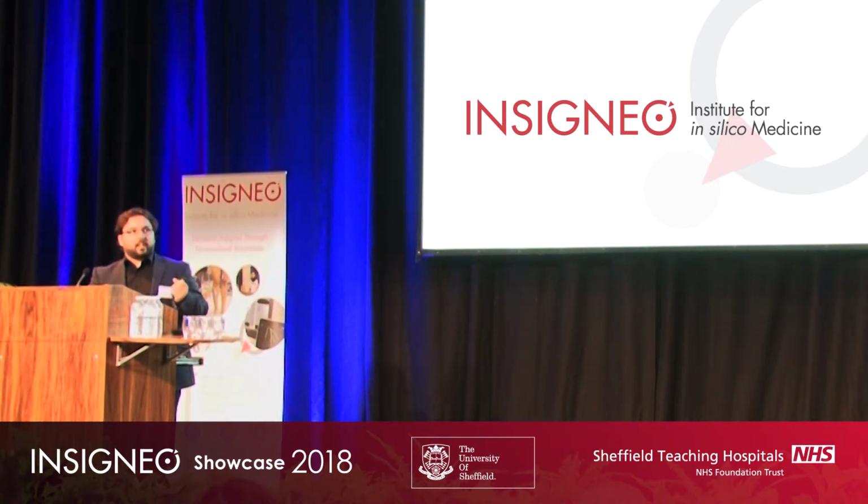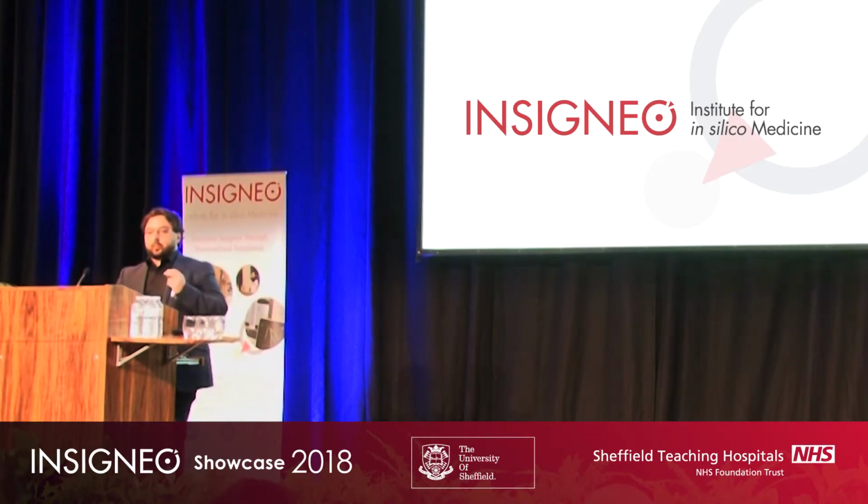We can take an image of the sample in the undeformed or preloaded condition, like the red dot, and then we can perform a second scan after we applied a certain loading condition. In this case, it's uniaxial compression, and we perform a second scan at that loaded configuration. Then we can use an elastic registration algorithm to track the deformation, applying it directly to the acquired 3D images. We don't need speckle; we use the features of the object.